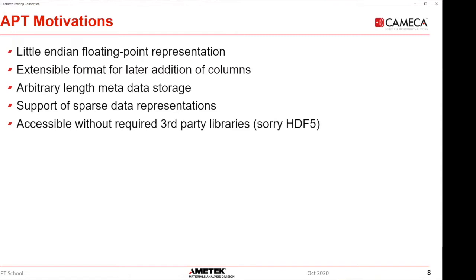Let's say you wanted to partition your data into two phases, phases 1 and 2. It often doesn't make sense to write a 1 or a 2 for every ion in the entire set. Maybe you can just say the first 100,000 ions in the set are phase 1, and the next million are phase 2. That saves a lot of data without having to write the entire column.